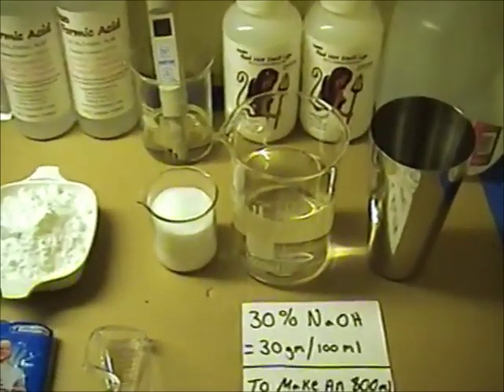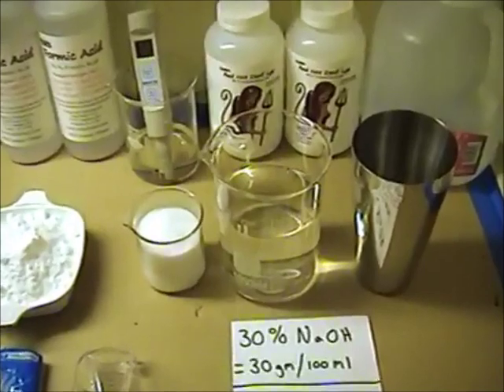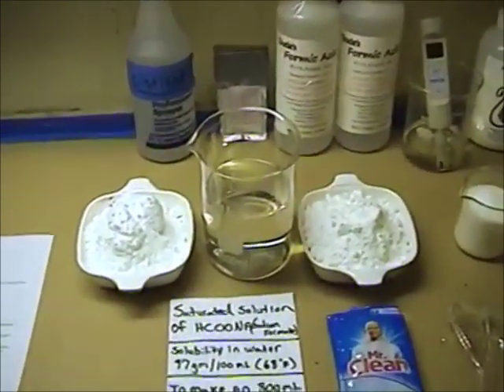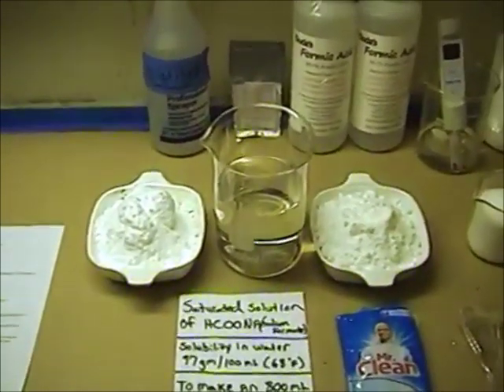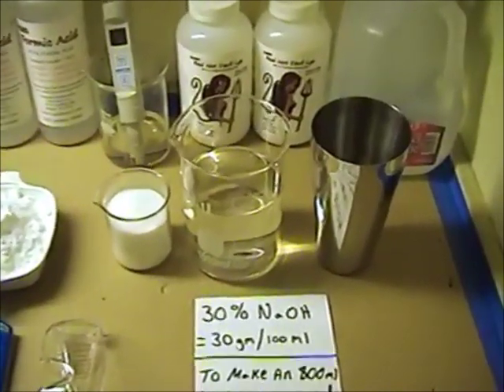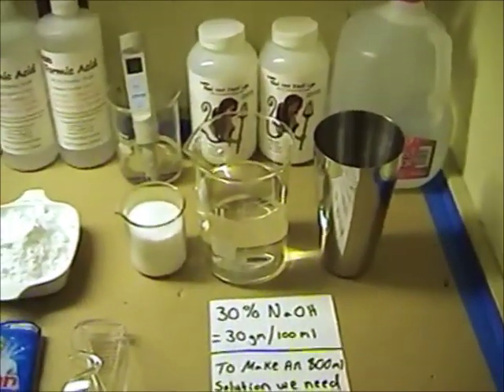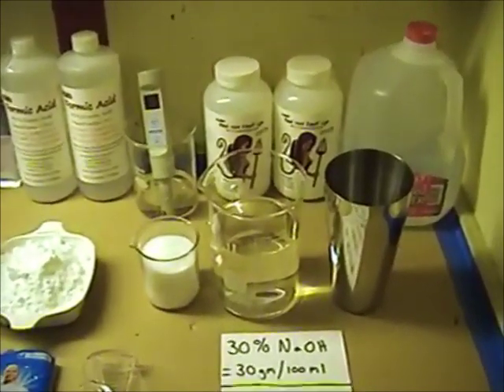And the reason that I'm scared of sodium hydroxide is acids attack metals. Bases attack organics. Well, your skin happens to be organic. It's not a metal. So as much as we like to be scared of acids, and you've seen on TV where the bad man throws the acid in a person's face and their skin melts off, acids won't attack flesh near as quick as sodium hydroxide does. And we're going to have to heat this up to dissolve our sodium hydroxide into our solution.